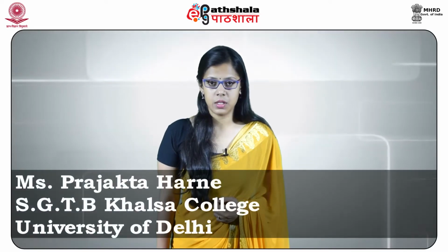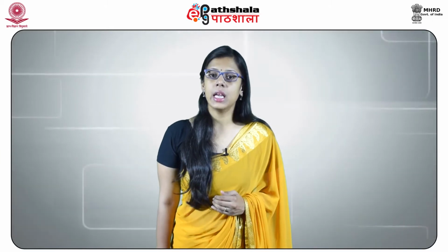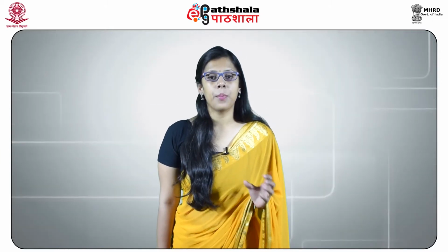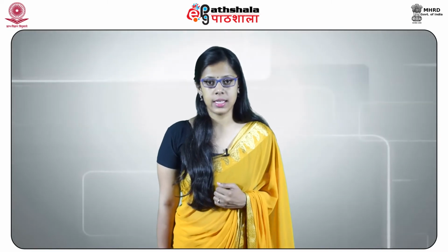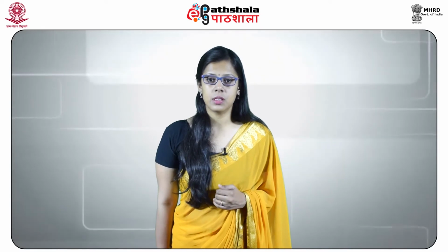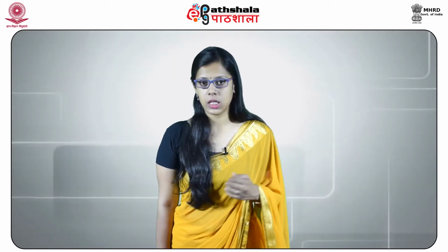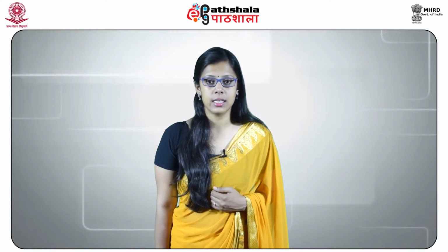Learning outcomes. After studying this module, you shall be able to know some important instruments and techniques used in forensic science. You will learn the fundamental principles of some important techniques. You will also be able to understand the working of some instruments which are used in forensic science investigation.